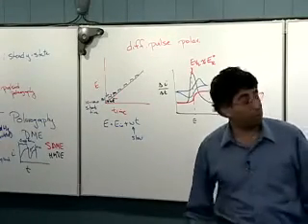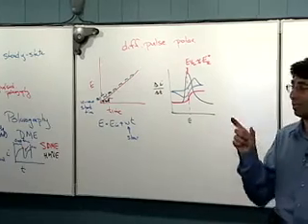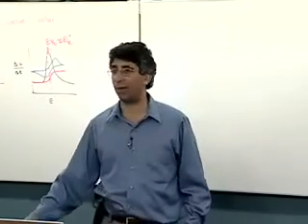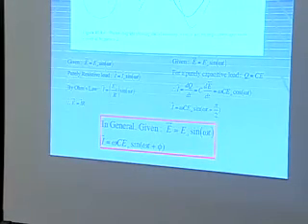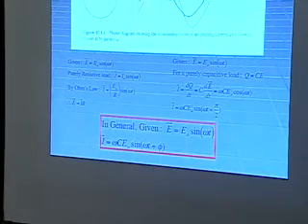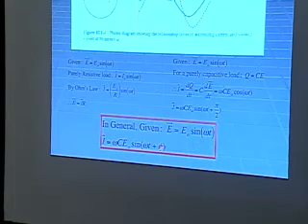Another experiment, and the one I want to focus on, that you can do essentially does not have a DC component. Just have an AC component. And so our variable now is going to become the frequency. Okay, so we're not going to scan our potential at all. We're going to fix our potential. We pick a potential that from some other experiment we know something about, and we just are going to change our frequency and look at this phase shift as a function of frequency.